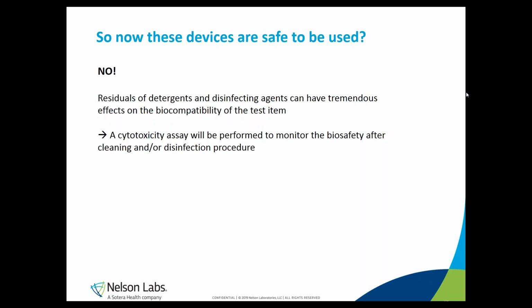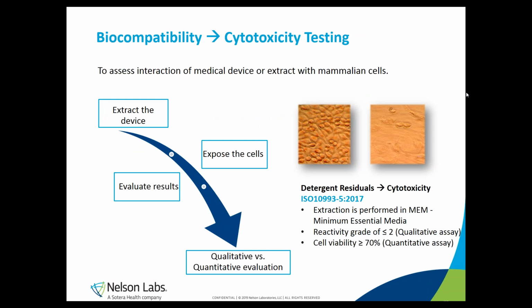Therefore, Nelson Labs will perform a cytotoxicity assay to monitor biosafety of the devices that have been processed. The big advantage of a cytotoxicity test to monitor biocompatibility during processing validations is that the test is not only cheap, but also fast and sensitive. After a completed cleaning and disinfection procedure, the device is extracted in MEM complete medium, which is compatible with the cytotoxicity test system.